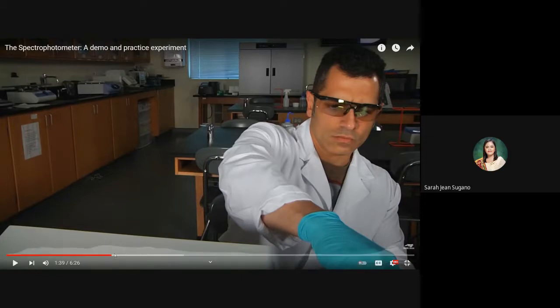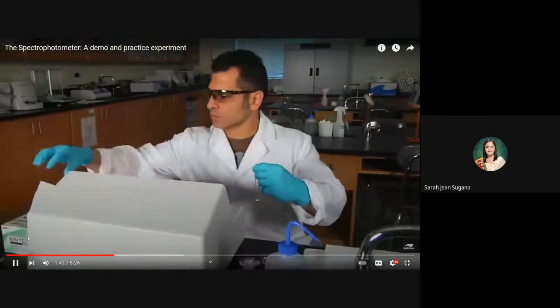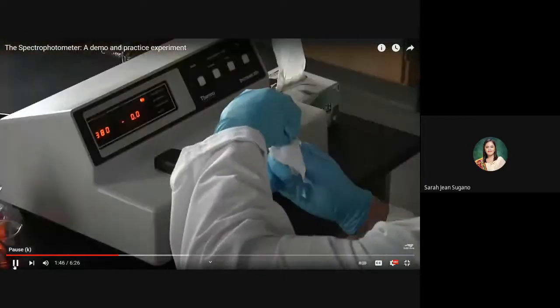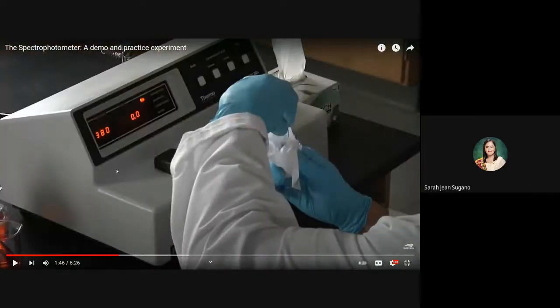So, here is a classic equipment. The basic equipment for the spectrophotometer. There are two cuvettes. One contains only milli-Q water. This is our blank. So blank is the one that contains the distilled water.